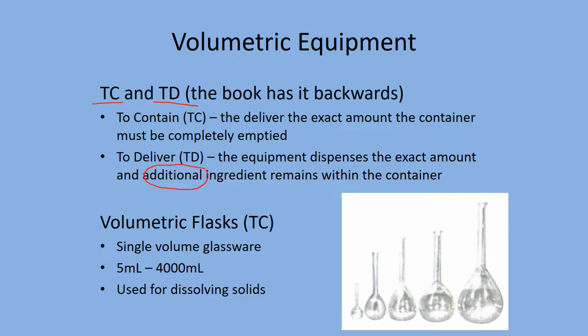All right, so our first piece of glassware, volumetric flasks. They're a one-trick pony. They only measure one volume. That's it. So if you go up to this line, that's 5 mLs. If you go to that line, that might be 10. That line, 50 mLs, 100 mLs. Go to that line, 250. And that's it. It's good if you want an exact volume.